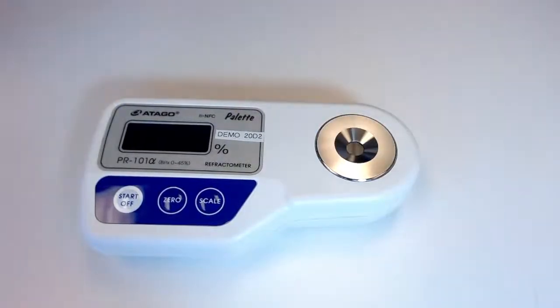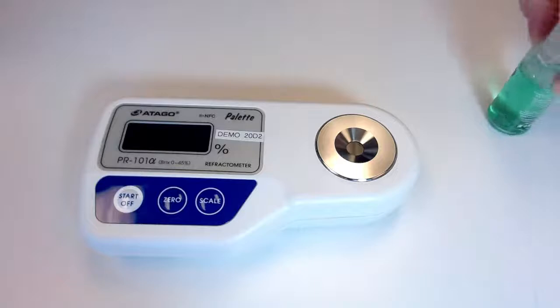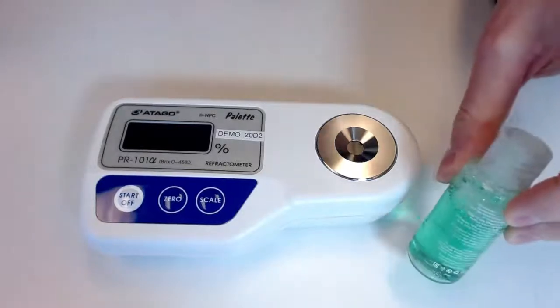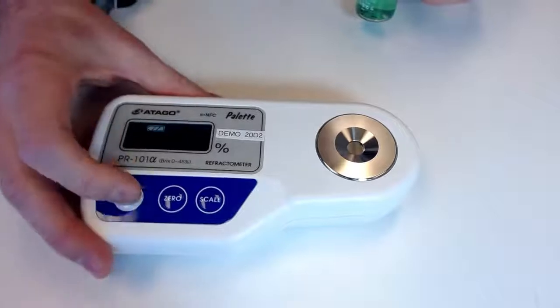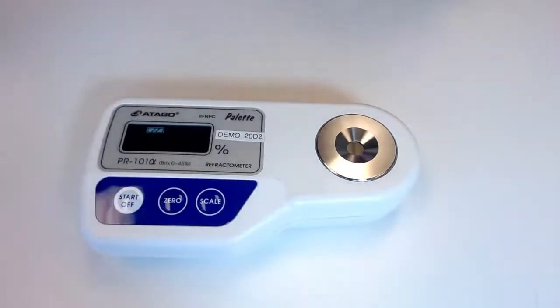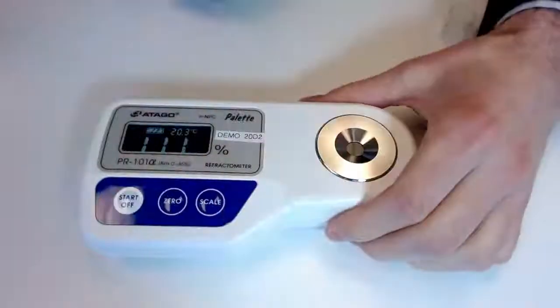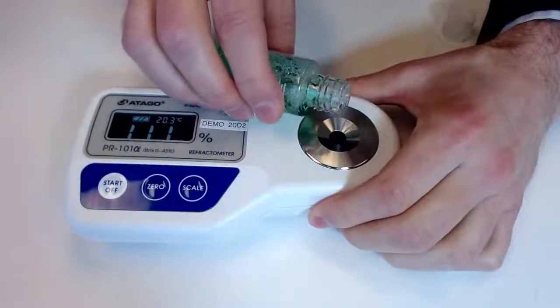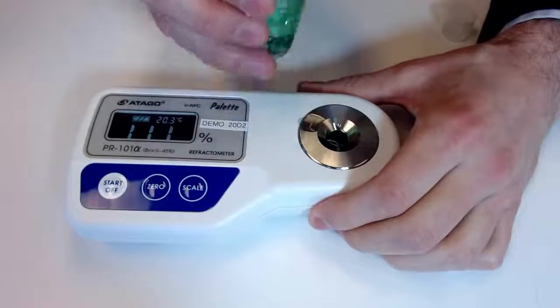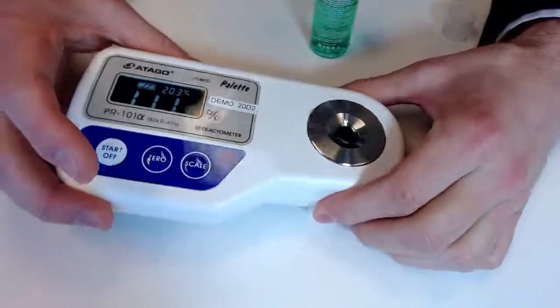And here we have just some generic mouthwash, which again, very different product type, but could fall right in our bounds here. So we'll hit that start button, make sure we're good. We really don't need much at all.